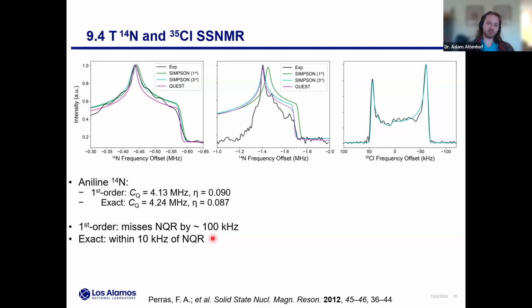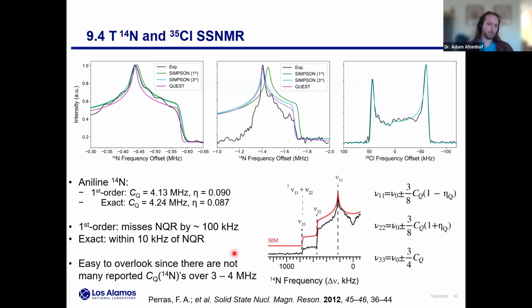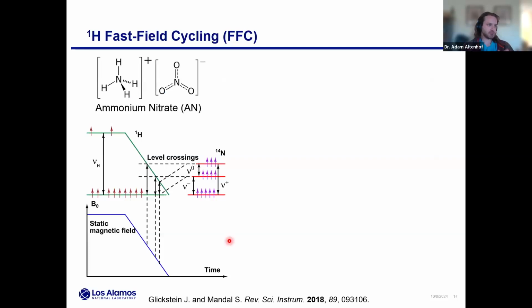This is a really significant thing to consider when the CQ is getting this large, perhaps less significant for the smaller CQ nitrogen sites. Just a note, if you do this frequency discontinuity fitting to solve for the tensors, this is again a first order approach, so it might fall apart for larger tensor values. I hadn't seen this before, and I think part of the reason is that not that many people are measuring 14N, and certainly there aren't many reports for these larger CQs, since it can be experimentally challenging to measure. So that was a bit of information on the EFG tensor parameters.